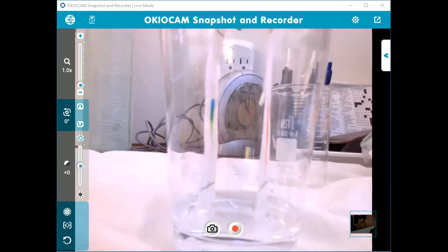I'm waiting for this to keep traveling. It travels for another 5 minutes or so before it starts to dry out, and that also depends on the humidity in your own home.